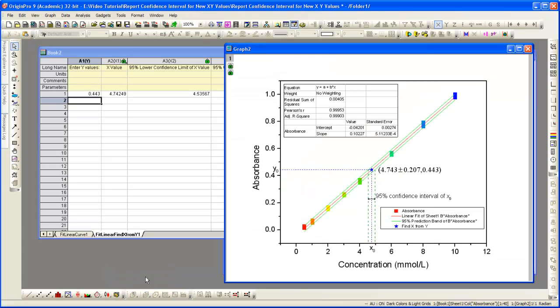You can add this data point to your existing graph. Here we have an example of a final graph where further customization, such as drop lines, was added.